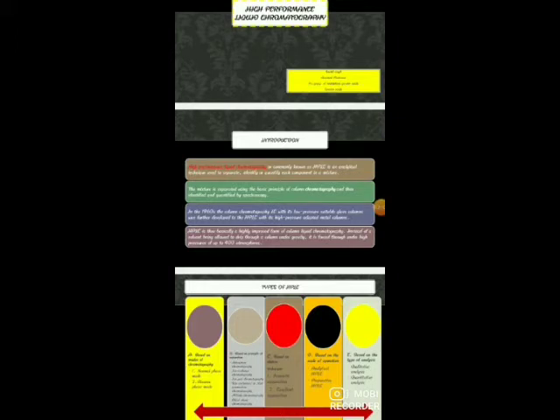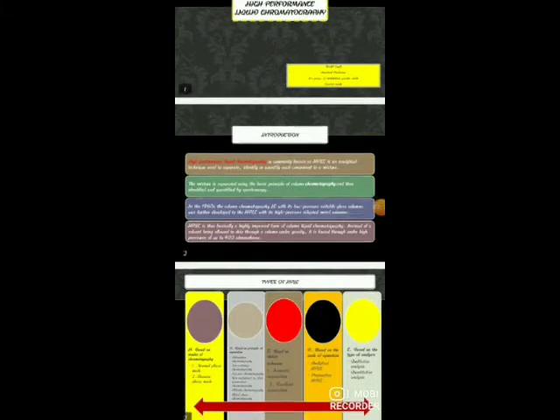Now the principle behind this HPLC is defined by the Van Deemter equation. Now for HPLC, the equation will be HETP is equal to A plus Cu. A is eddy diffusion and C stands for mass transfer rate, and mu is the flow rate of the mobile phase which is used in the HPLC. So the basic principle of this HPLC is based on the Van Deemter equation.